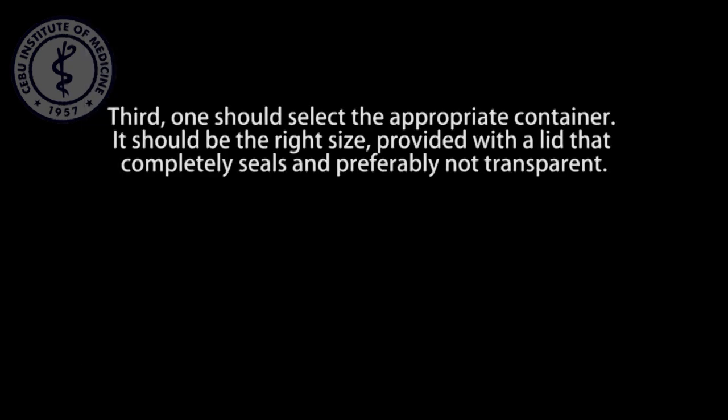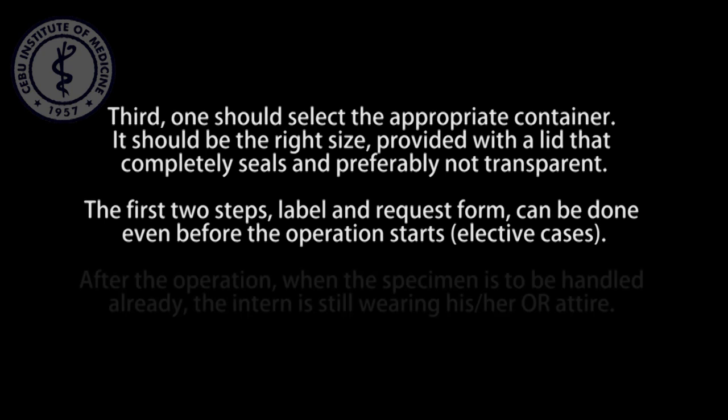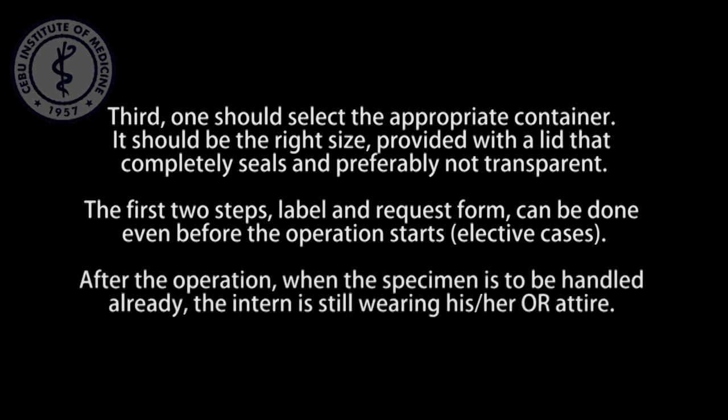Third, one should select the appropriate container. It should be the right size, provided with a lid that completely seals and preferably not transparent. The first 2 steps, label and request form, can be done even before the operation starts. After the operation, when the specimen is to be handled already, the intern is still wearing his or her OR attire.